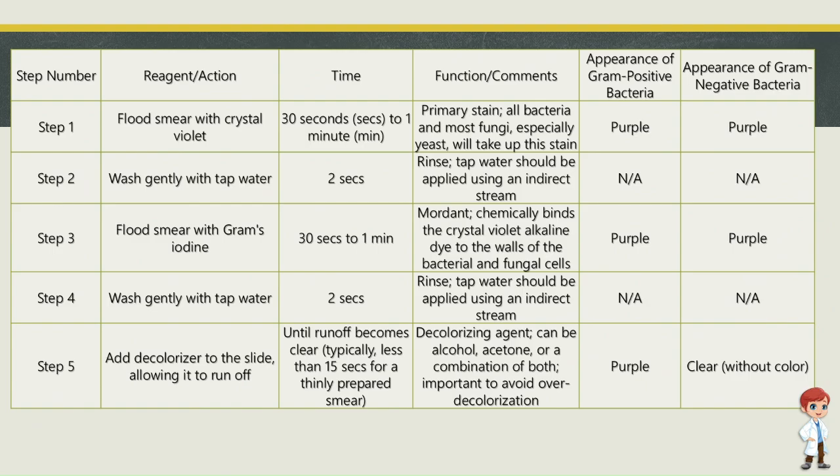Step 1. Reagent/action, flood smear with crystal violet. Time, 30 seconds to 1 minute. Function, primary stain, all bacteria and most fungi, especially yeast, will take up this stain. Appearance of gram-positive bacteria, purple. Appearance of gram-negative bacteria, purple.